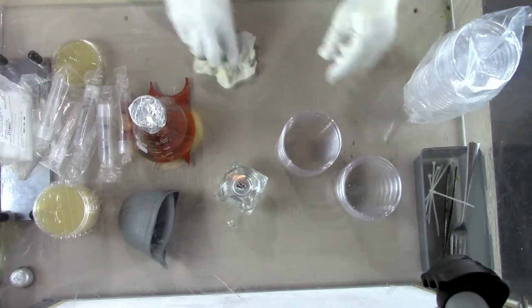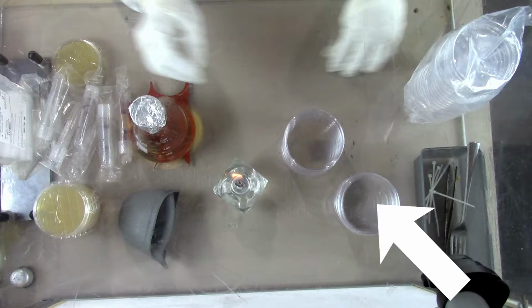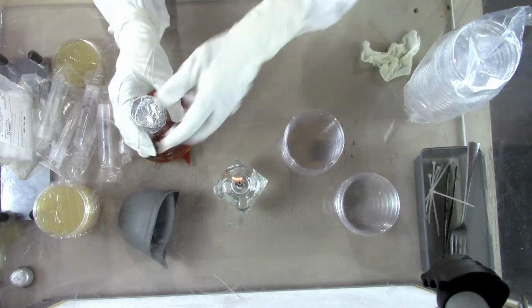First, you need to autoclave your nutrient agar. If you're using nutrient agar, as you can see here, it can be whatever type of media. If you're doing plates, of course, I have to have nutrients and the solidifying agent, which is the agar. The next thing that you need are the plates. These should be sterile plates because you're adding nutrient agar to them. In this case, I'm also doing slanted tubes, and of course you need a Bunsen burner or any burner that you have. In this case it is an ethanol burner.